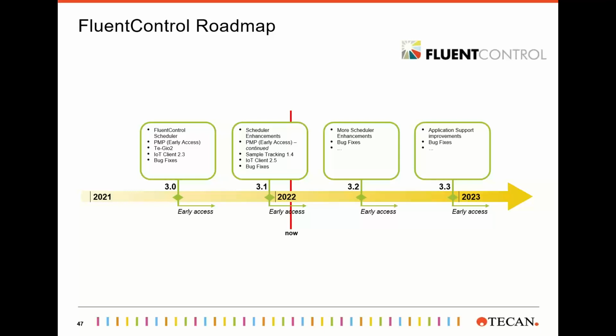And what we typically do is we release it first in what we call early access release. That's for about 8 weeks. And then we track who gets the software with the idea that we can then very directly get feedback from people using it in the field, and then see if they're happy with it and give them very direct help. And then we go into general release for everybody else.